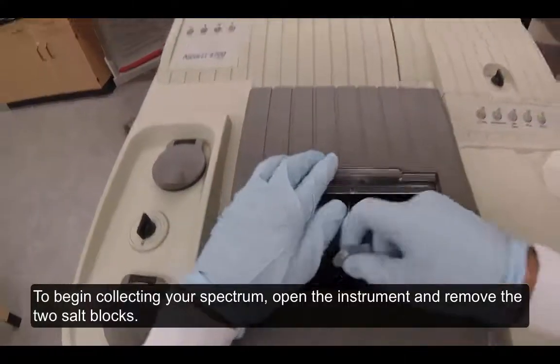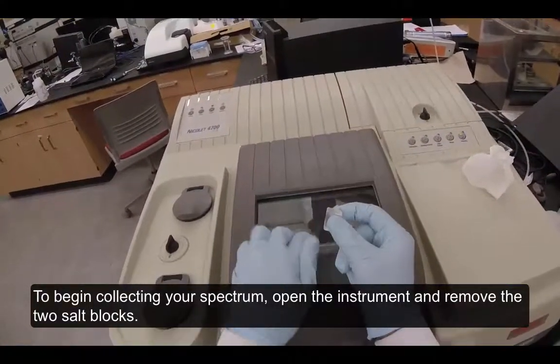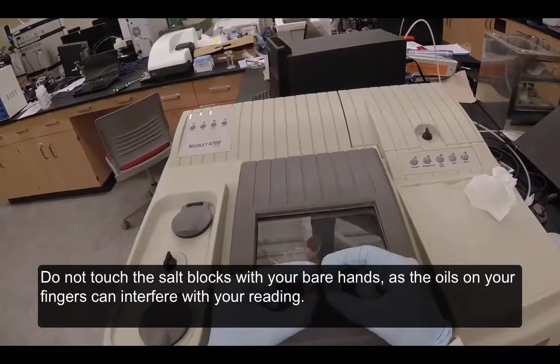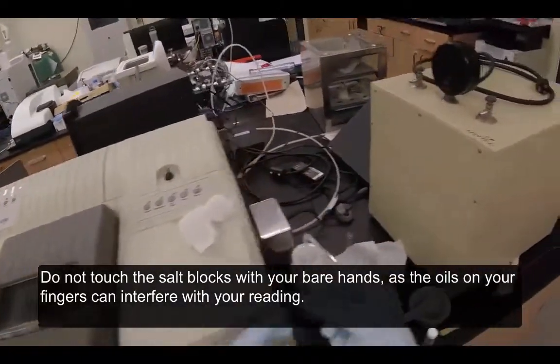To begin collecting your spectrum, open the instrument and remove the two salt blocks. Do not touch the salt blocks with your bare hands as the oils on your fingers can interfere with your reading.